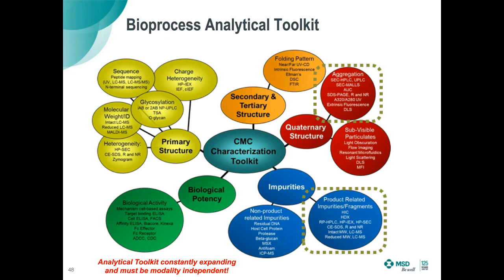So first, the biotherapeutics are very complex molecules and require many different assays to fully characterize them. Charge heterogeneity needs to be assessed by IEX. Peptide mapping can do sequence coverage. Today we're going to focus on aggregation and fragmentation, where we look at size exclusion, I think as Steve mentioned, and Michelle, where it was briefly discussed, and how you can use light scattering to help aid in that separation.